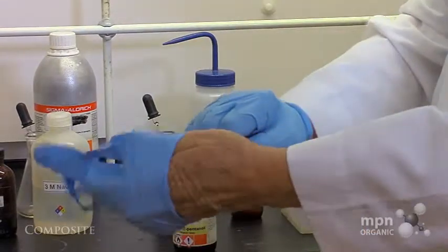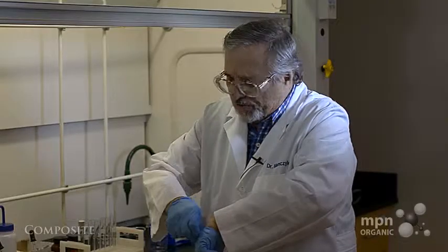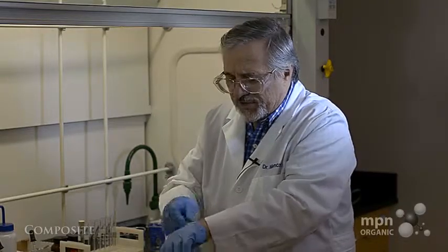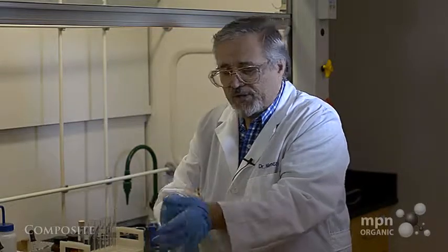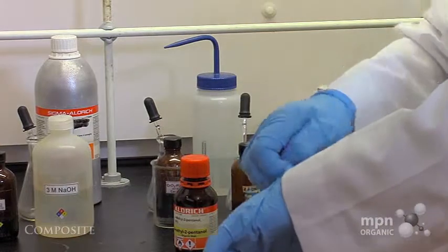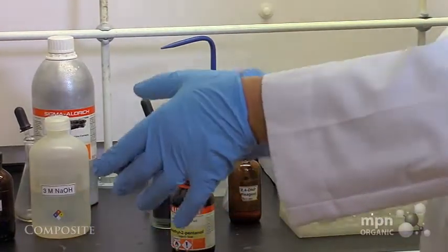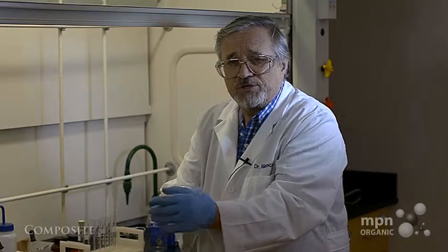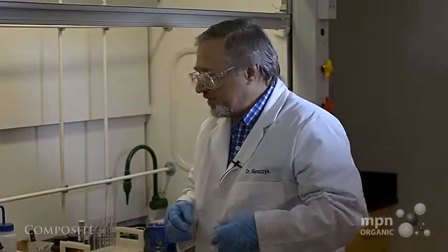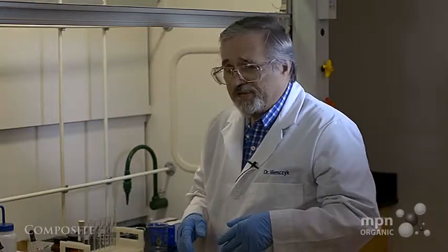And as I said before, when you're using chromic acid, the good thing is to not wear really good clothing, or, as I'm doing, wear some sort of shield, because the sulfuric acid and chromic acid, if it gets on your clothing, is very unforgiving. You discover after you've washed your clothing that you've got these nice big holes, and my wife can attest to this over the years that I've been here.